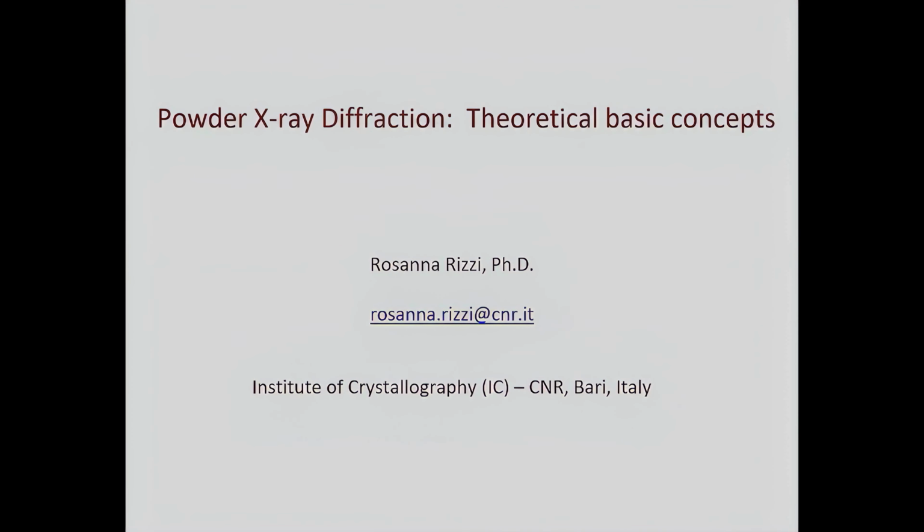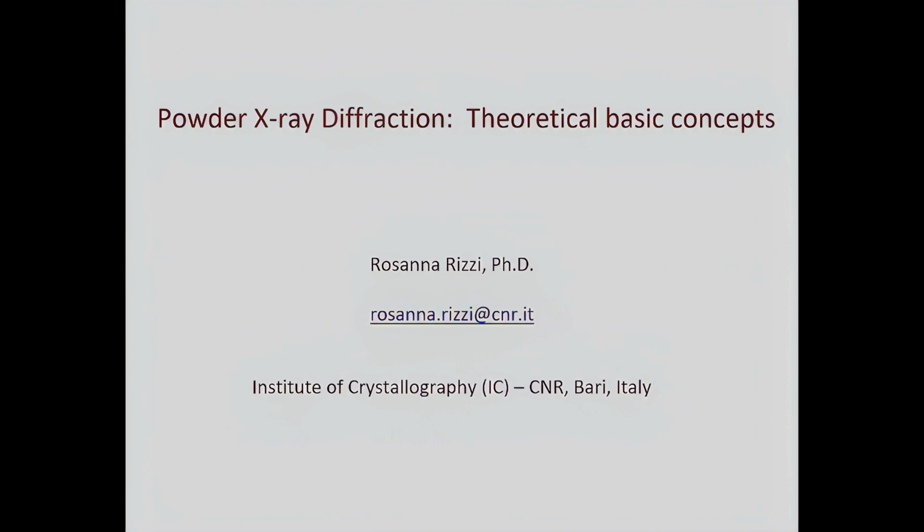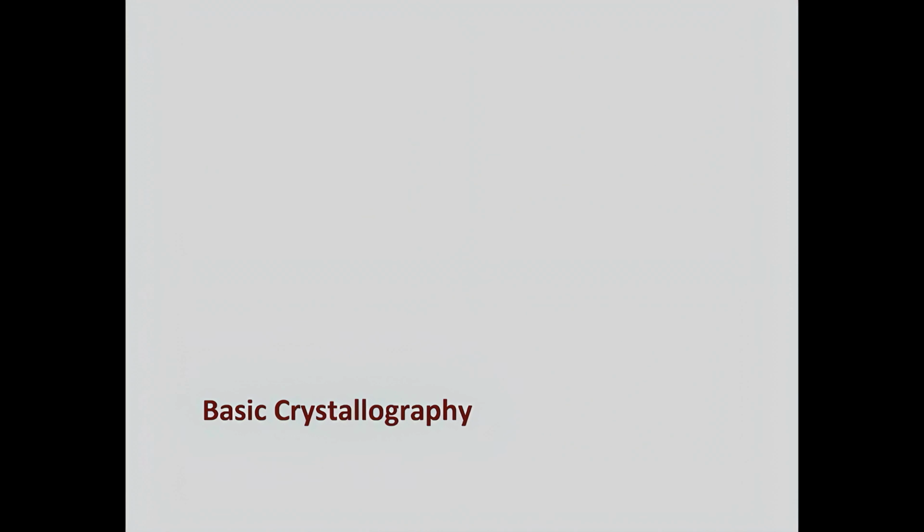Okay, then we are ready to start with the lessons. The first one is on the theoretical basic concepts of powder diffraction. And to better understand what powder X-ray diffraction is, and also the next lessons after me, I think it's necessary to refresh some fundamentals of crystallography.